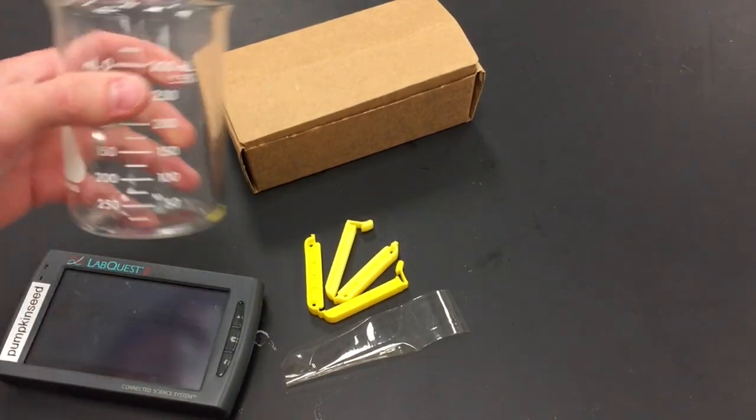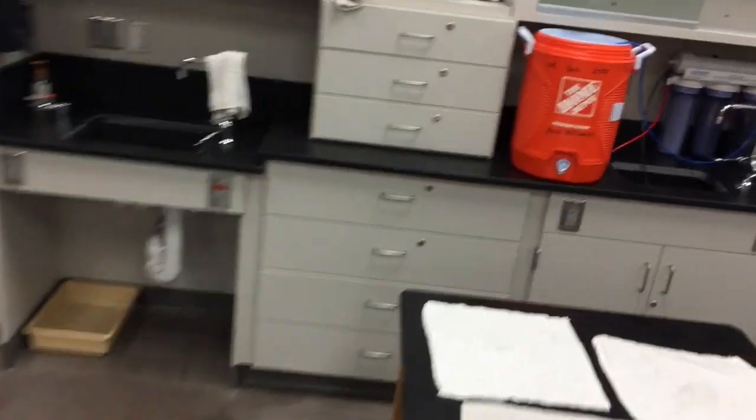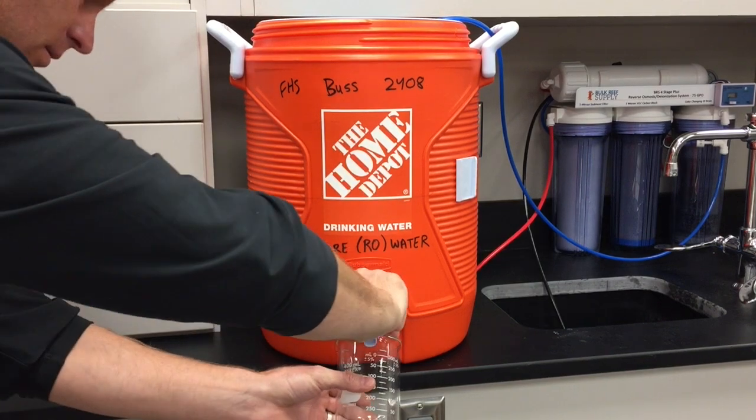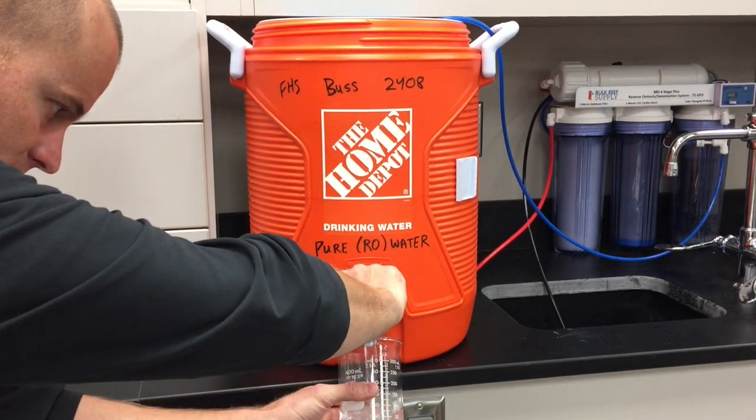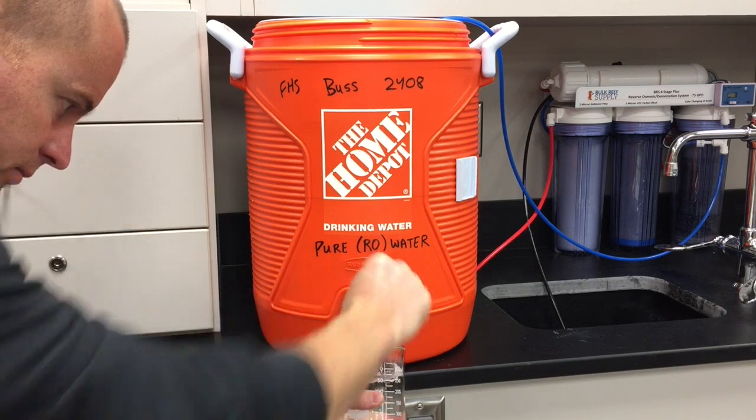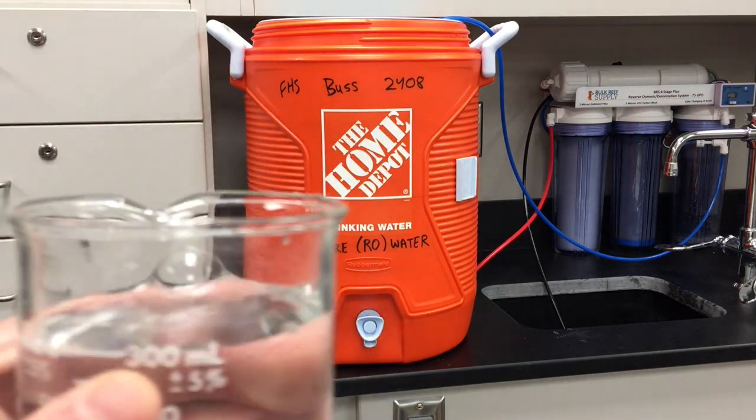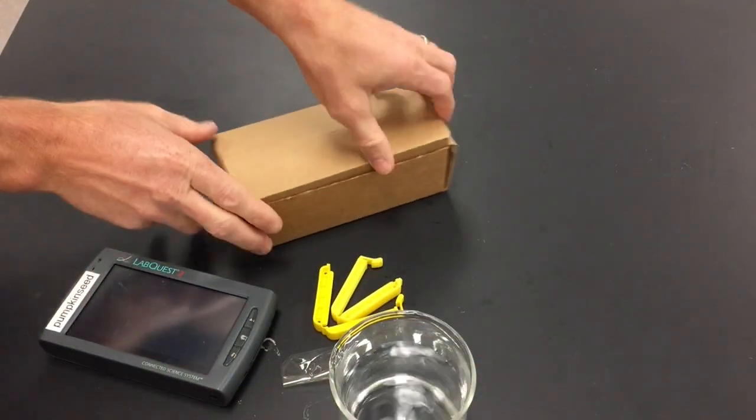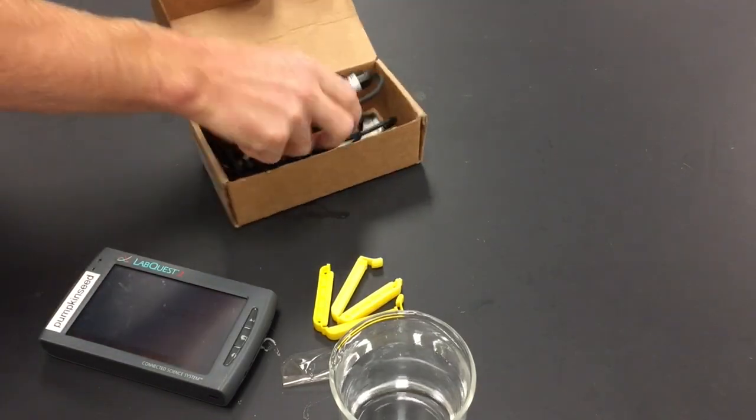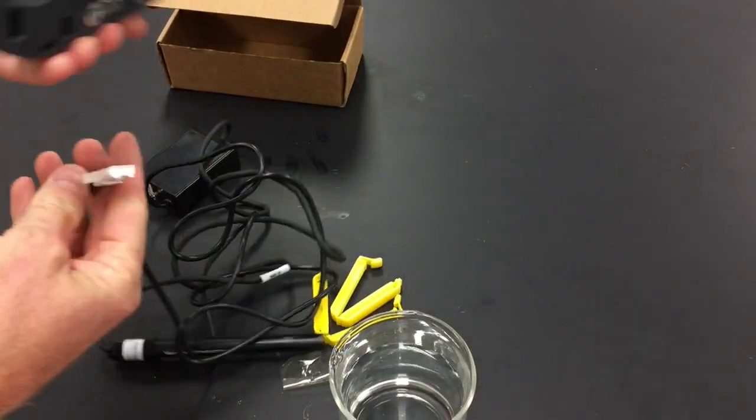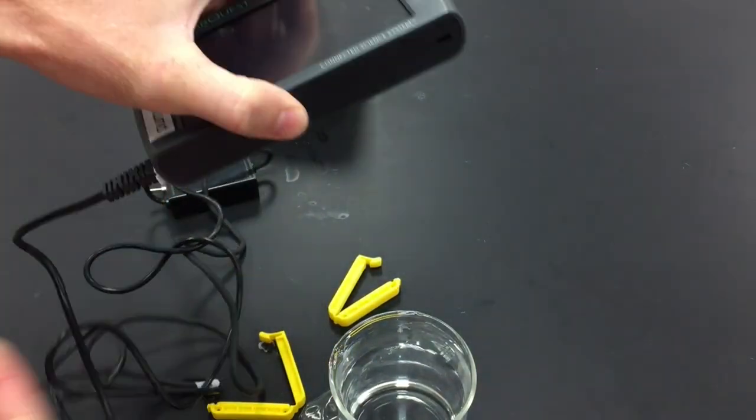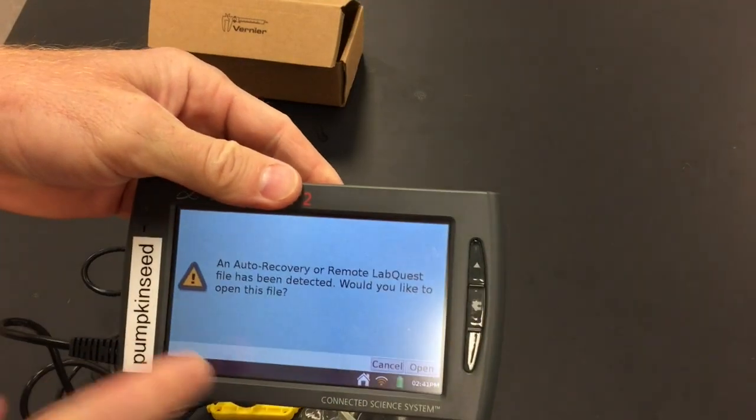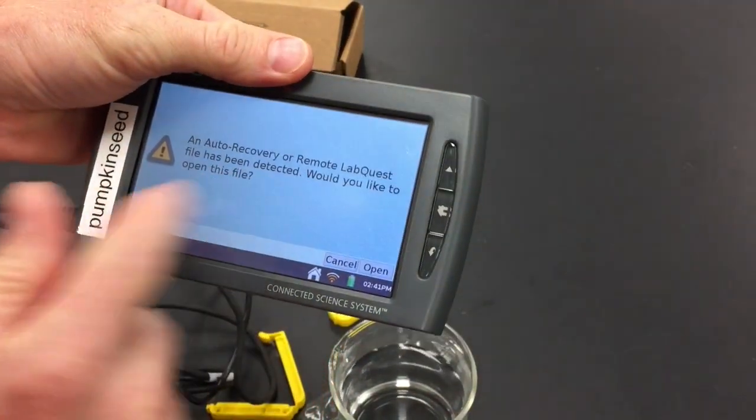We'll get the water for this first. Remember to use purified water. Fill it up to 300 milliliters. Go ahead and connect the conductivity probe to the Lab Quest.